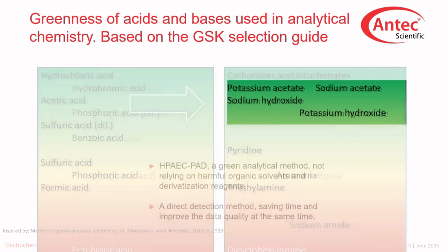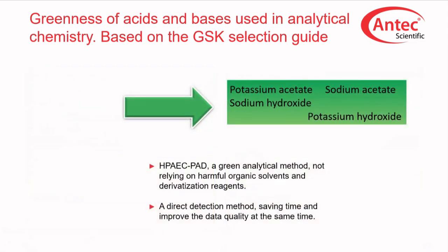If we zoom into the critical part, the important part for us, we see sodium acetate, potassium acetate, sodium hydroxide, and potassium hydroxide in green. Essentially, these are the elements we use in HPAEC-PAD for carbohydrate analysis, and that is the green surprise. HPAEC-PAD addresses many aspects of a green method, an analytical approach that does not rely on harmful organic solvents or derivatization reagents. It allows for direct injection and detection, saving time while also improving the data quality because there is no need to handle or train derivatization techniques.